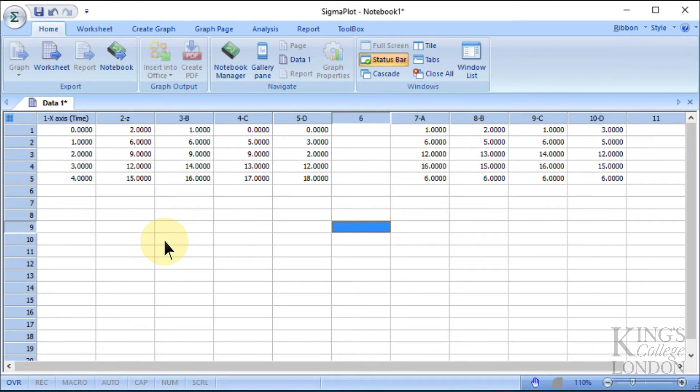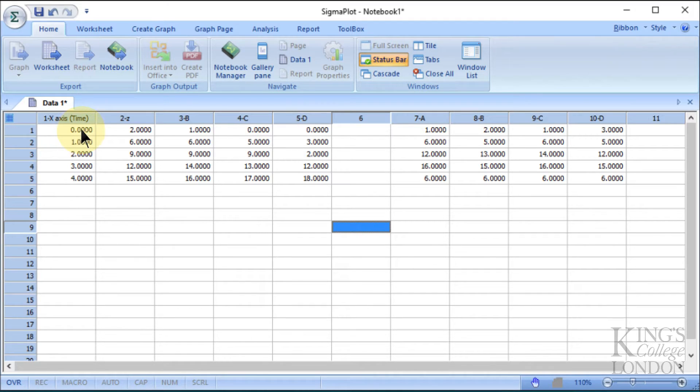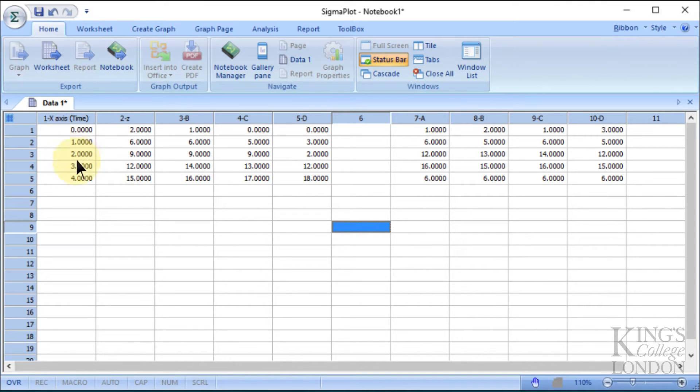So here we are in Sigmaplot version 13, and we have some data already entered into our data sheet in notebook number 1. This data has been used in a previous tutorial. We've got some x-axis data here, labeled as x-axis, which is from 0 through to 4, and let's just for the sake of argument say this is seconds, so it's time in seconds.